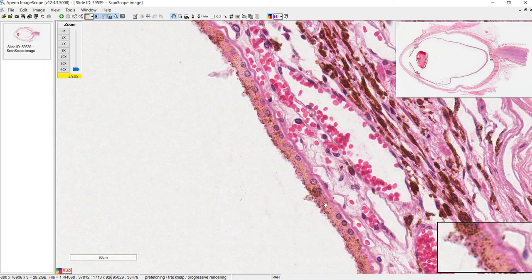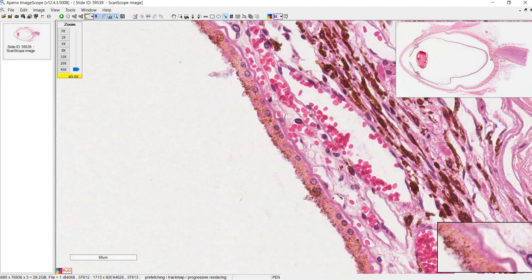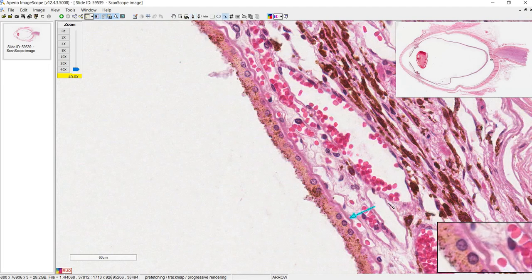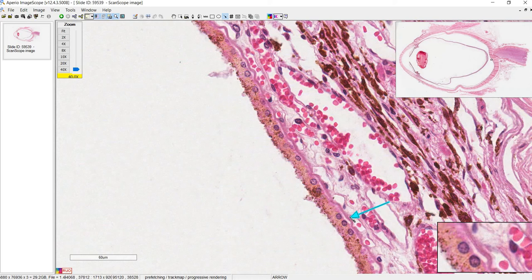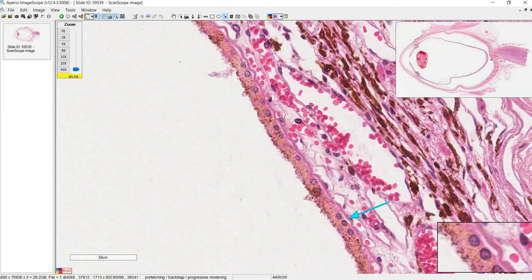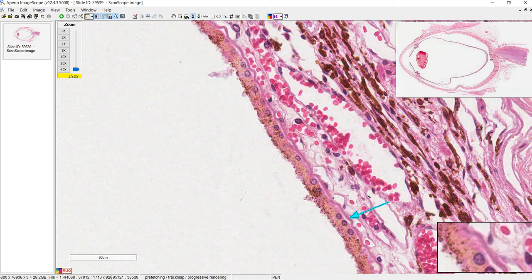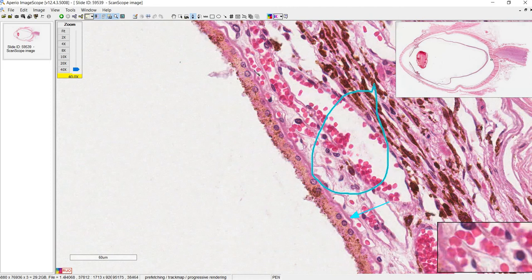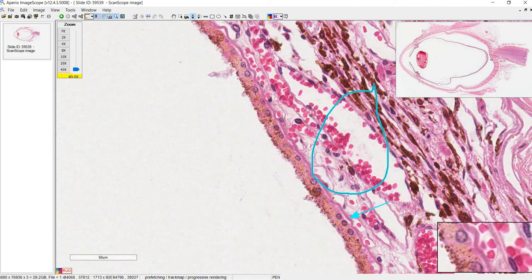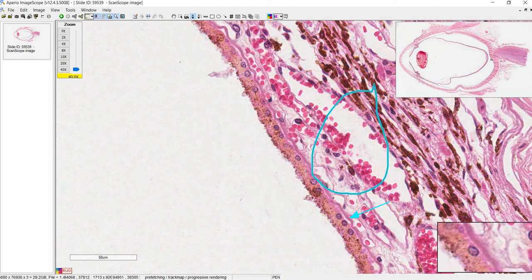Just like any epithelium, the RPE has its own basement membrane, which is extremely important — it's called the Bruch's membrane. You can see it here as a fairly thick pink band that the RPE is sitting on. If there's a disruption in this membrane, blood can get in — and that's what wet macular degeneration is. Just past Bruch's membrane is the choroid, which provides all the nutrients for the retina. The layer immediately past Bruch's membrane is specifically the choriocapillaris — a thin layer of capillaries right next to the membrane.